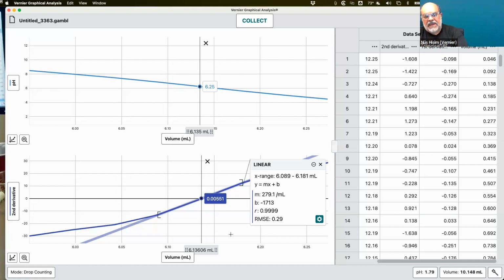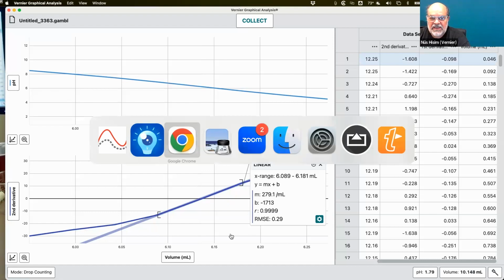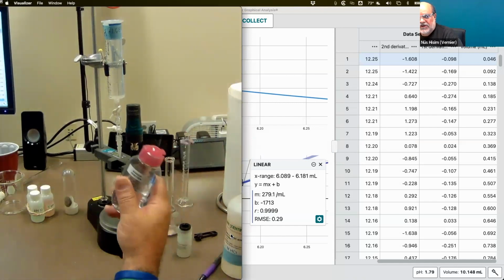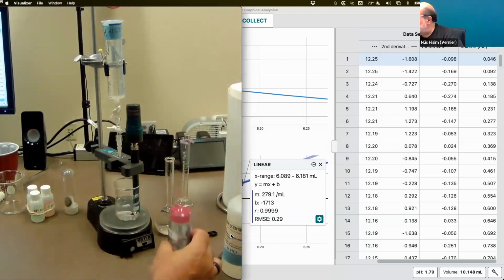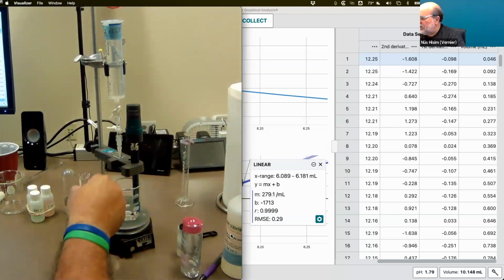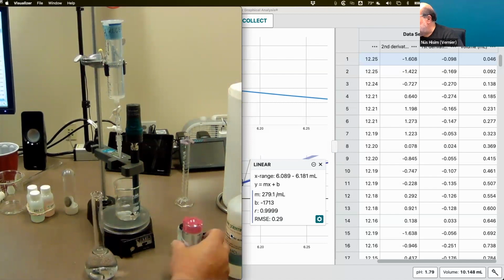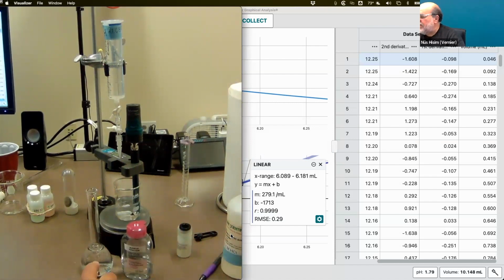So what do they do now? Well, if I gave you the handout, what the students have is the equivalence point for the diluted makeup remover. Now it's a bunch of paying attention to the process, right? Because they diluted this based on their pre-lab, and then they did a titration.